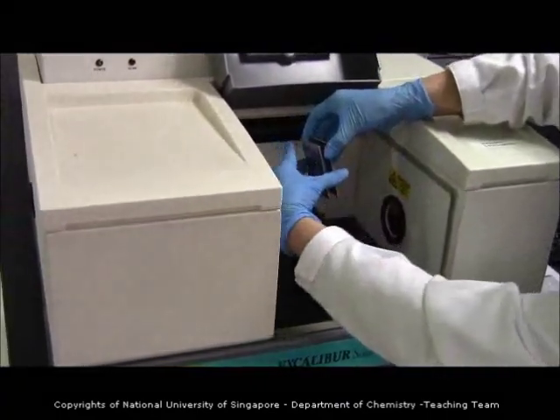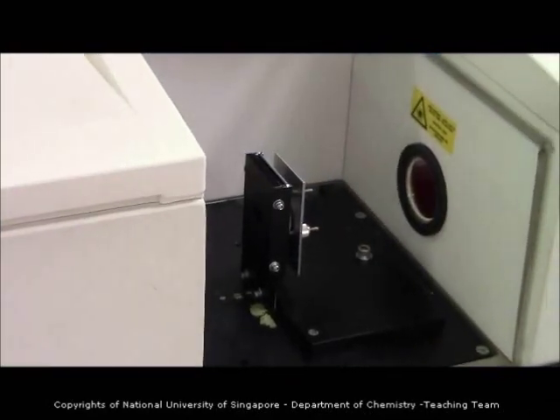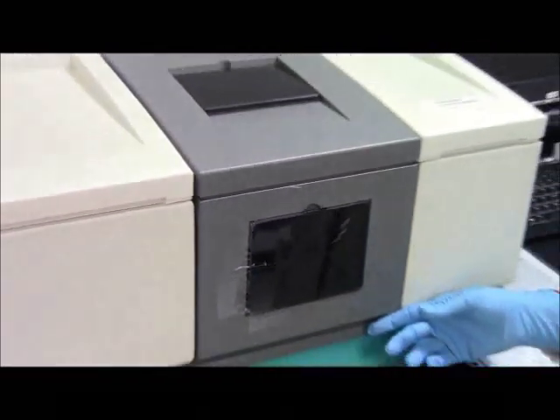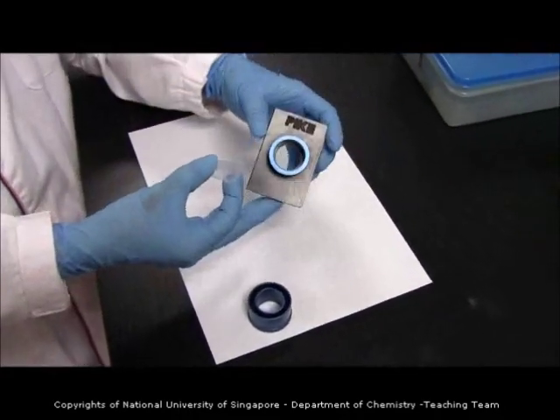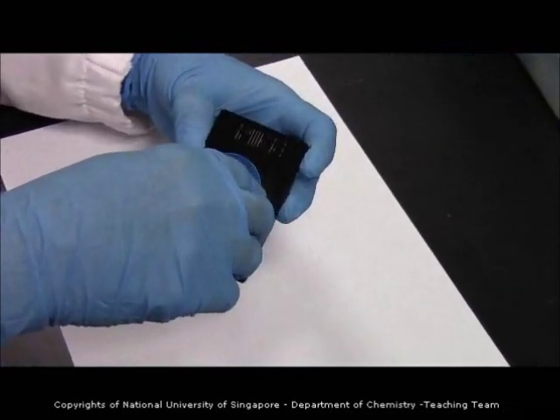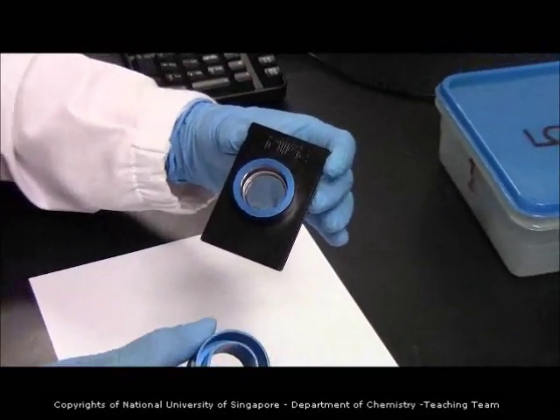Now you can place the sample holder into the FTIR machine for scanning. For sodium chloride plates sample holder Type 2, all you need to do is take your sandwiched sample and put it into the cavity of sample holder Type 2. After that, turn the cap on, rotate it in, and seal it.